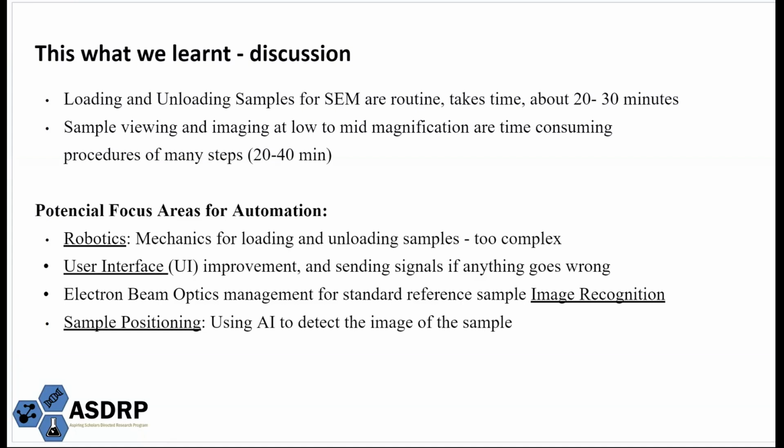Next part is the user interface (UI) improvement and sending signals if anything's wrong to the person controlling the SEM, and the electron beam optics and managing it for the standard reference in sample image recognition.